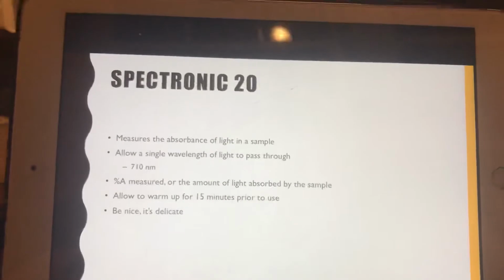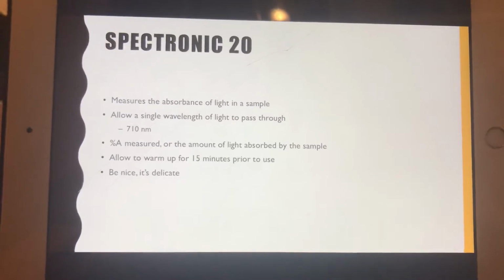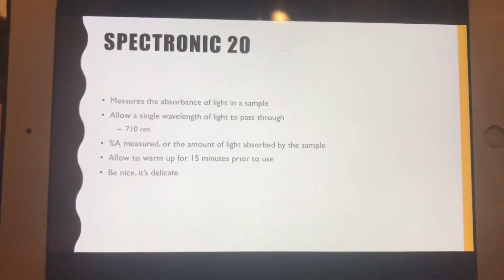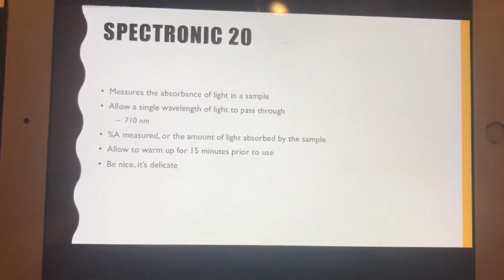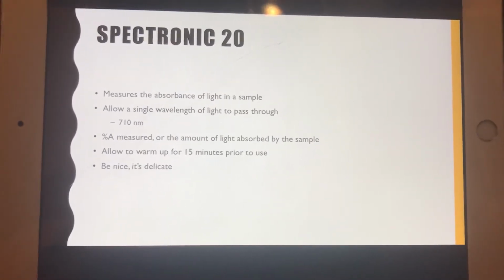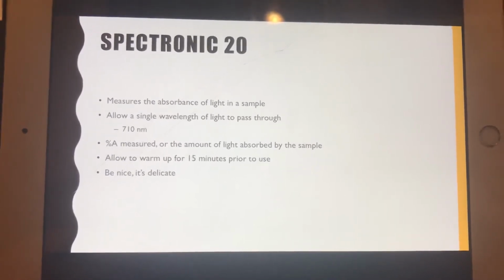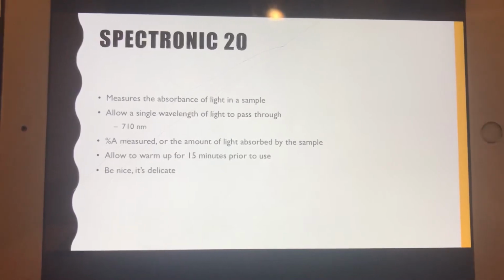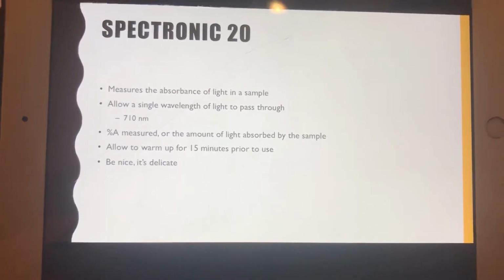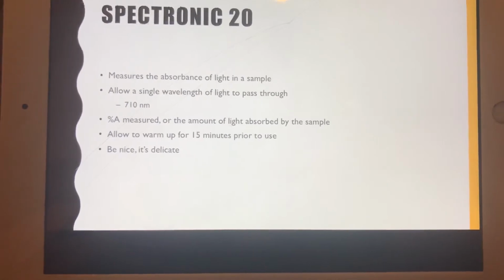Just a little bit of background information first. The premise of this experiment is that a gentleman was found dead on the side of a road in, I believe, Robbins. His hair and clothes were completely saturated with water, and upon autopsy it was determined that he had drowned. He wasn't near a body of water up in Robbins, so they looked at the water in his lungs and found that it had a really high phosphate concentration. So they sampled lake water from the surrounding areas, those 4 lakes I mentioned, Lake Pinehurst, Wood Lake, Seven Lakes, and Reservoir Park, and we are looking at phosphate concentrations.